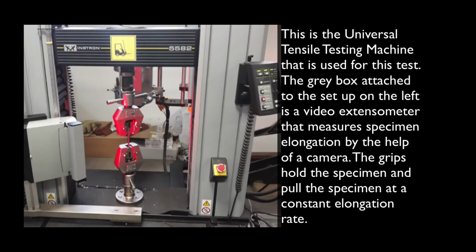This is the universal tensile testing machine that is used for this test. The gray box attached to the setup on the left is a video extensometer that measures specimen elongation with the help of a camera. The grips hold the specimen and pull the specimen at a constant elongation rate.